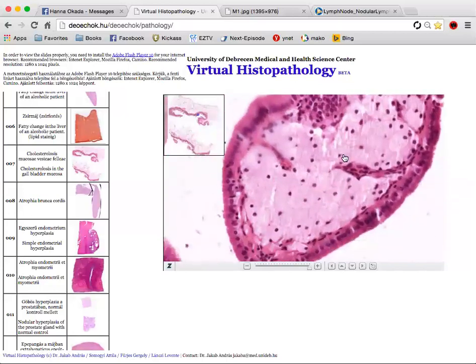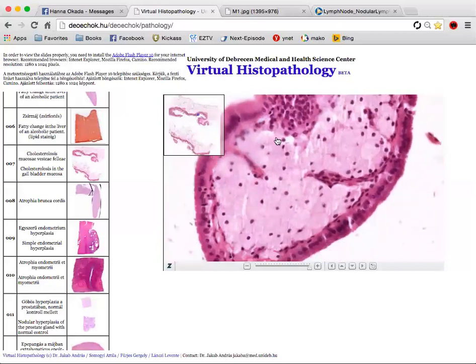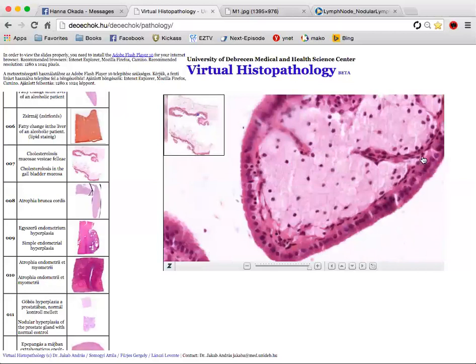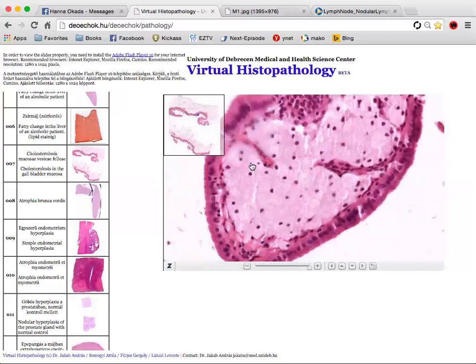You have to say that the epithelium is intact and it's columnar and it's showing gall pigment. And in the lamina propria, you see that it's filled. First of all, it's distended, so the villi are club shaped. And you can see that it's full of foam cells, which are macrophages that have ingested cholesterol. Thank you. Got it. Foam cell is the macrophage.